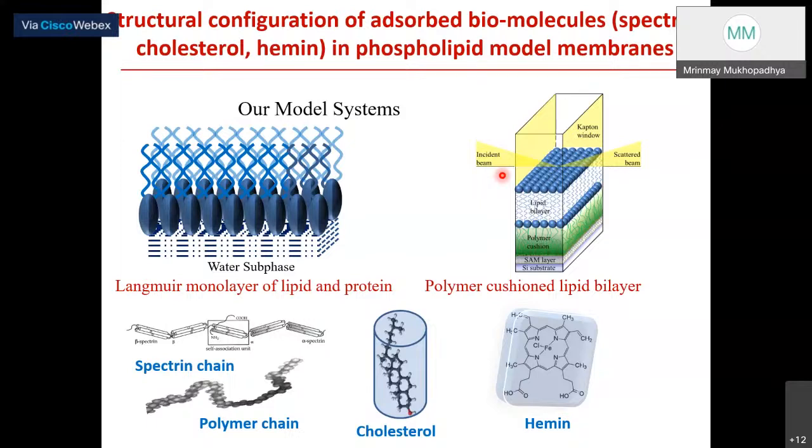This is not exactly the cell biology that you people or other people do with real cell molecules or real cell membranes. This was done with a specific molecule. So let's see how DPPC is interacting with this molecule, how DPPE is interacting, or how DPPS is interacting with this molecule.